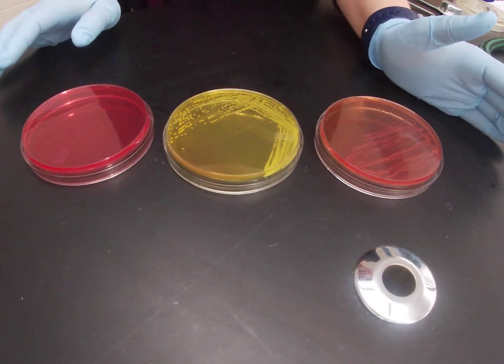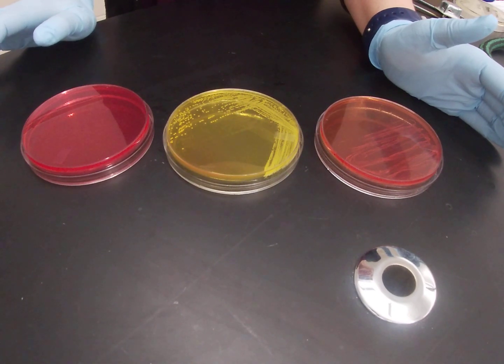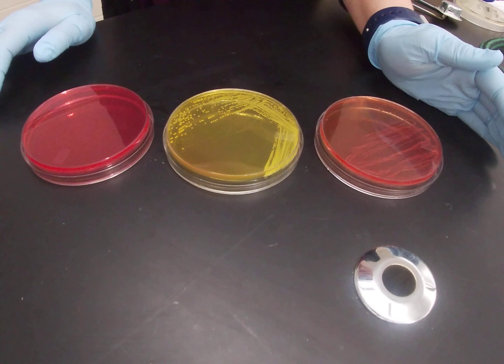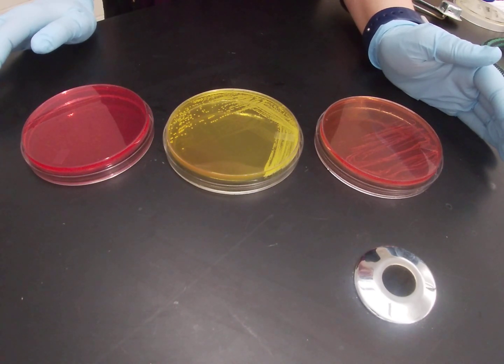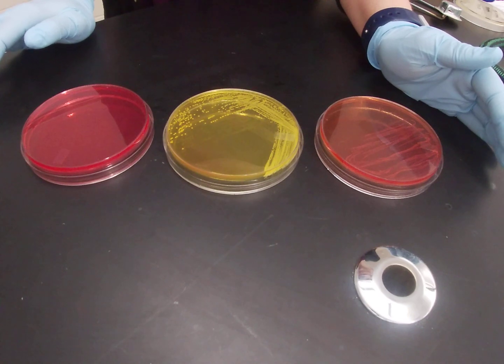In this video we are going to describe mannitol salt agar. Mannitol salt agar is an agar that is very useful for the identification of gram-positive organisms, especially differentiating between our different kinds of staph species. You won't find mannitol salt agar on your flow chart, but that does not mean that it's not a really useful agar and one that I would expect you to use during your unknowns.